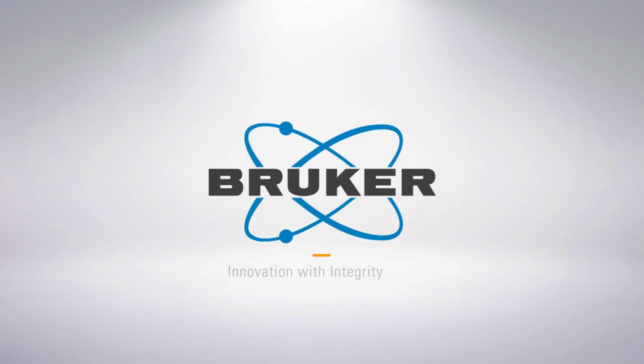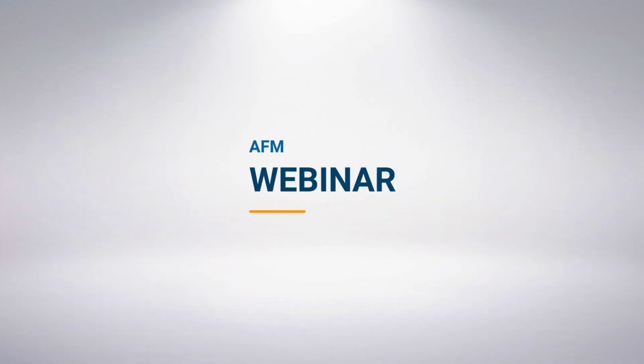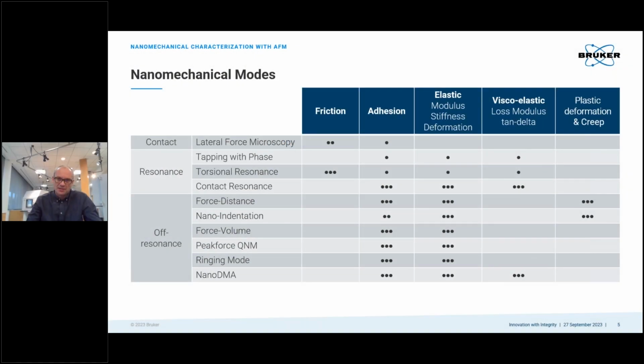Because there's many mechanical properties. First one is friction, next one is adhesion, and then we have a series of elastic as well as viscoelastic properties. And then there's also some plastic behavior. So I listed them out here, and in the rows, I listed out a number of modes. These are not all the modes that one can do with an AFM, but I would say the most common ones, and maybe also some more for historic reasons in here.